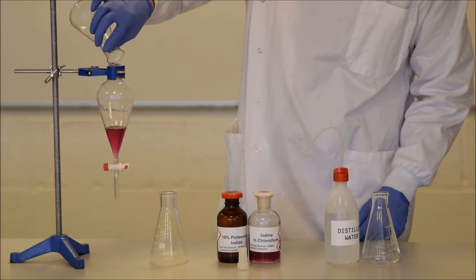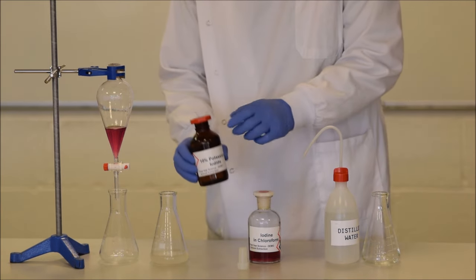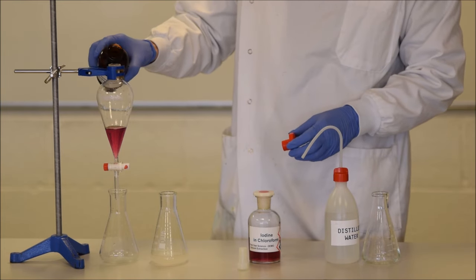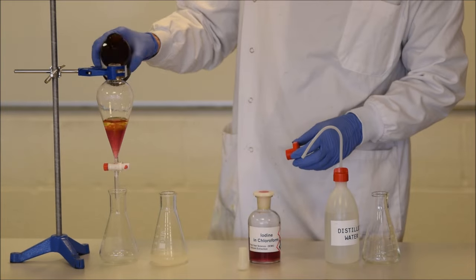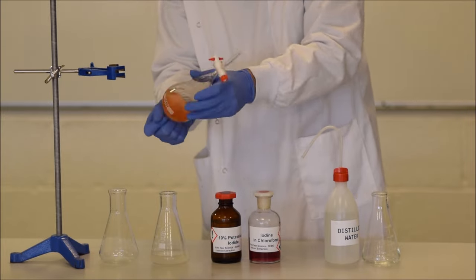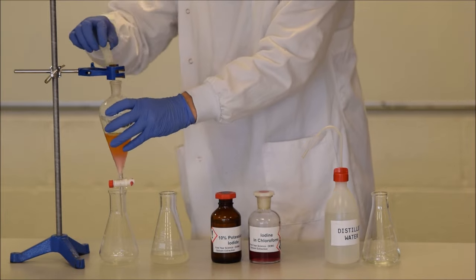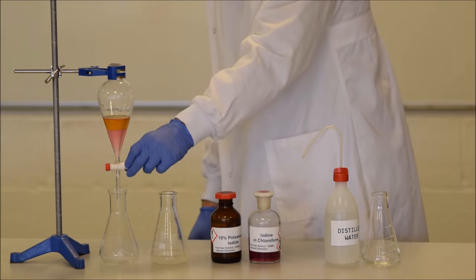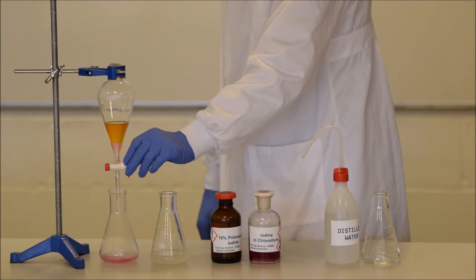So if we give this a go and we extract it, we should be able to take the pink or purple colour out of the chloroform. Watch as I pour this, I'm going to pause it for a second and see that the liquid is clear before it hits the water. And as soon as it hits the water, it starts to extract out the iodine. But of course, we can very much speed it on its way by giving it a good shake. And you notice that I vent it, shake it, vent it, and that the chloroform now has significantly less iodine in it. And you can tell that based on the color of it.